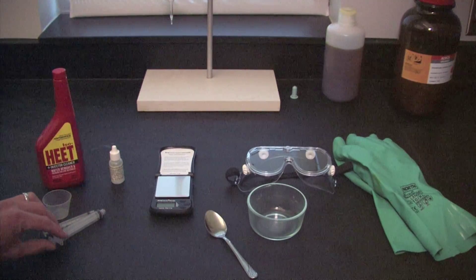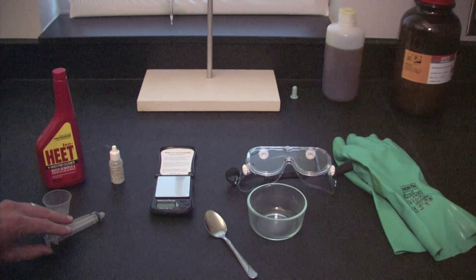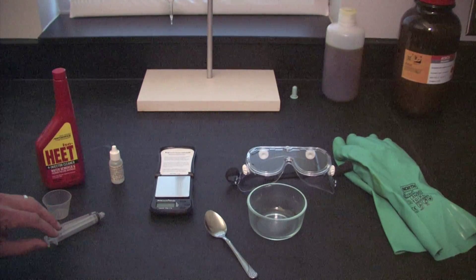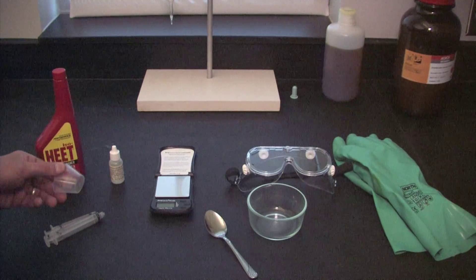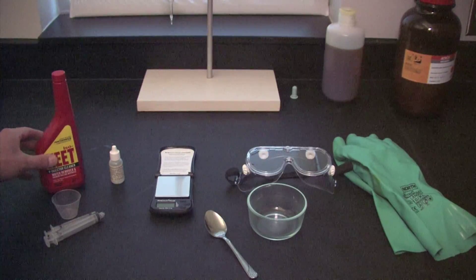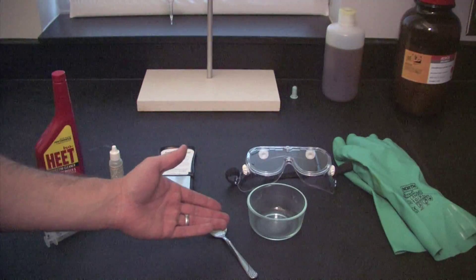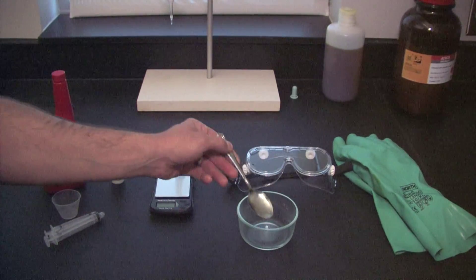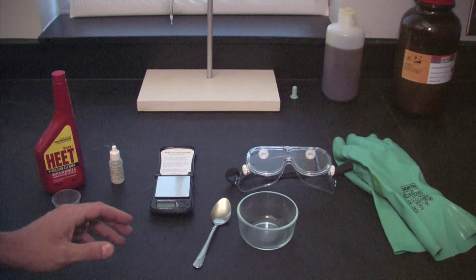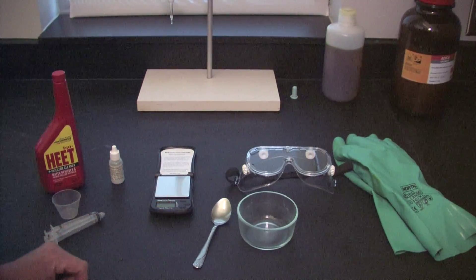We've got some syringes that we're going to use to measure out different volumes of the potassium hydroxide solution. We also have a medicine cup that we're going to use to measure out the isopropanol. And then lastly, any sort of container — preferably glass — that we're going to mix all of the material in, and then something we can use to mix it all together. Next we're going to go through the actual process where we add the different chemicals and our indicator and go through the titration process.